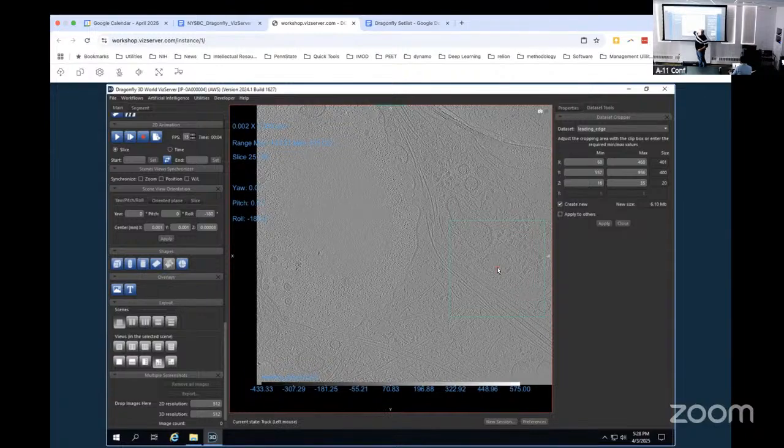We're going to do a network that tries to find microtubules and ribosomes, so I pick a spot where I can get both of those features. But if you're training your own network, you have to figure out where those features exist. Sometimes it's hard to find them all in one small spot, and you might need to cut out multiple chunks and train that way. But once you have that, just hit apply on the right.